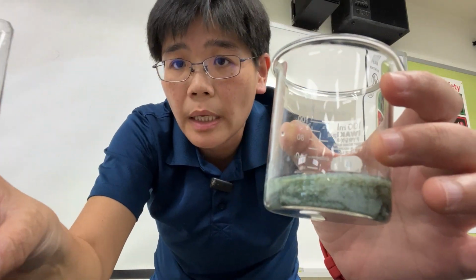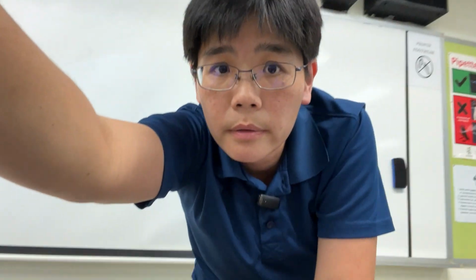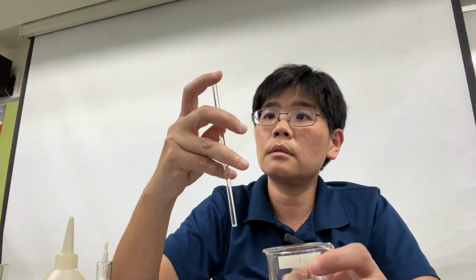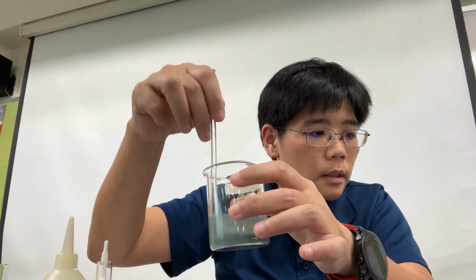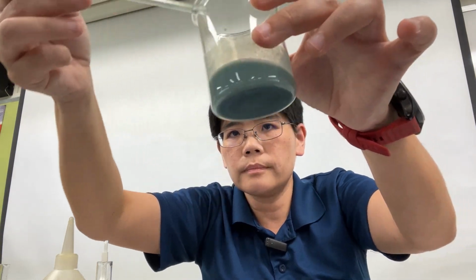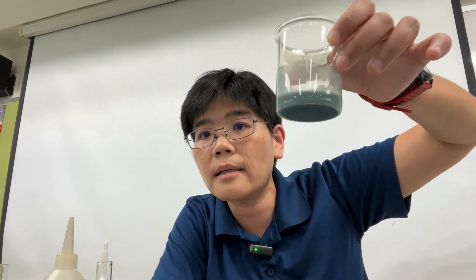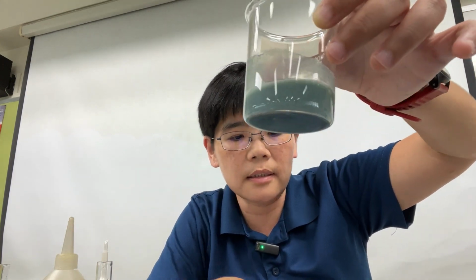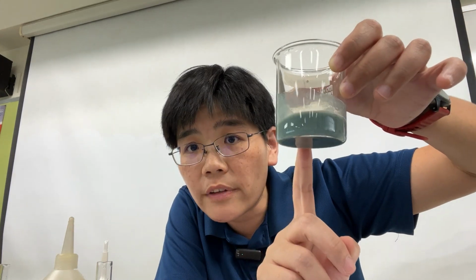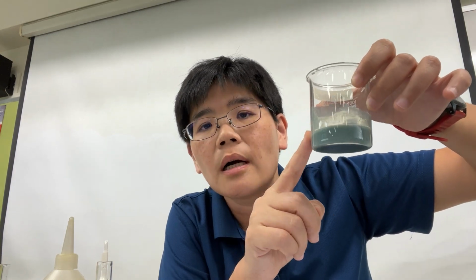After we put the chemicals together, what we will always do is stir to mix well. So here we are, I use the glass rod. Stir to mix thoroughly. Here we have an observation: a color is exhibited, and there's a certain texture to it. What we notice is now light cannot pass through the mixture.